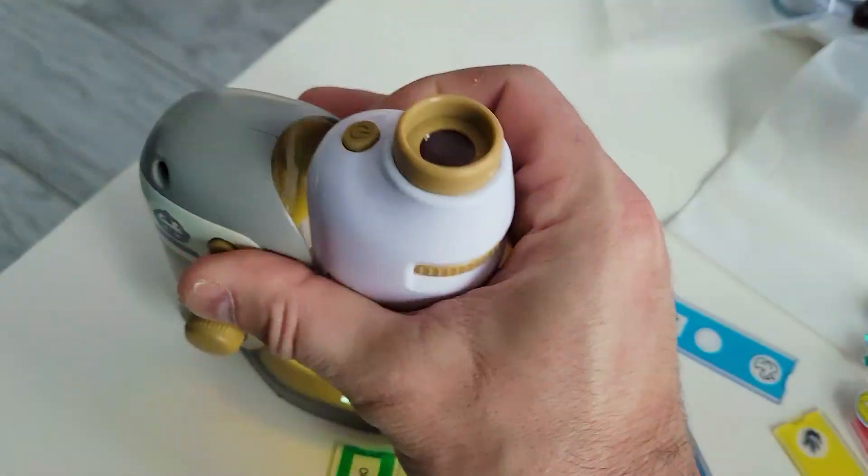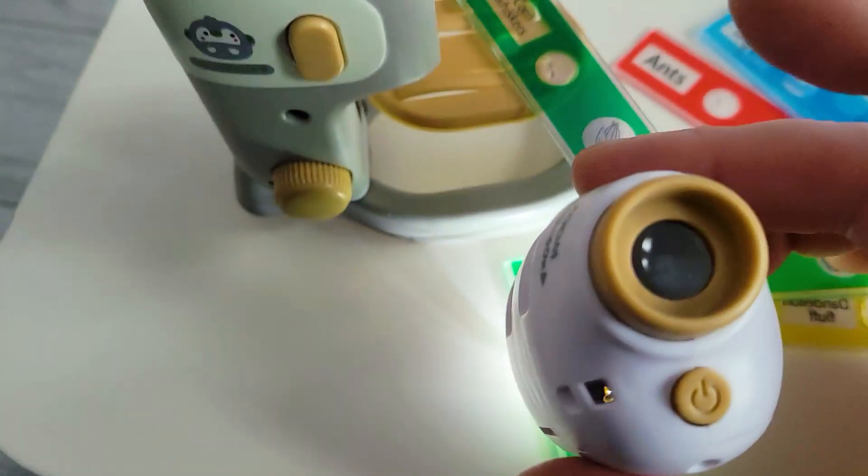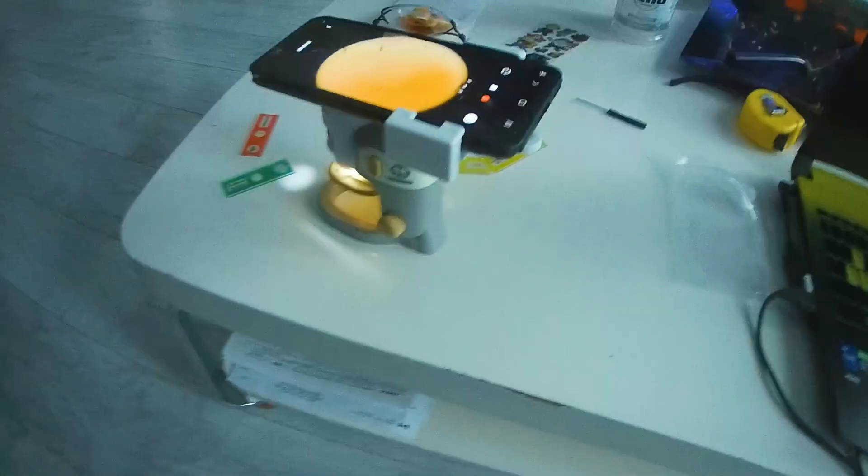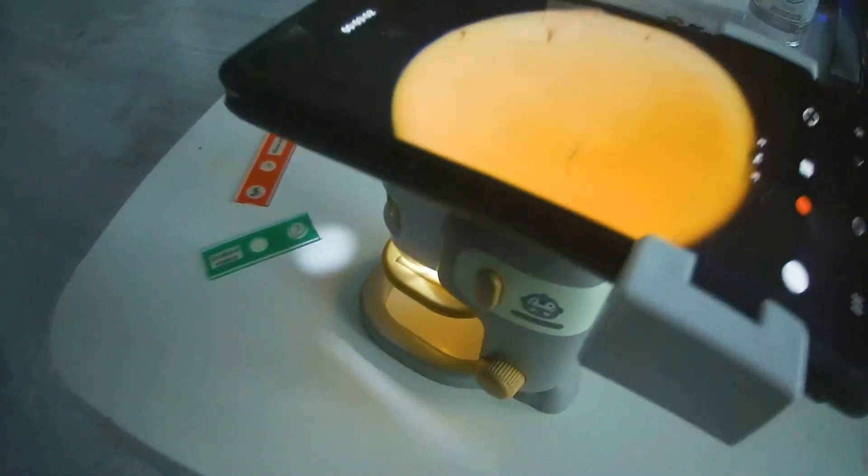And as a bonus, this is portable, so you can take this with you on field trips to the pond, and you can even record what you're seeing with this provided phone mount. If you're ready to dive into science, stay tuned for the whole video.